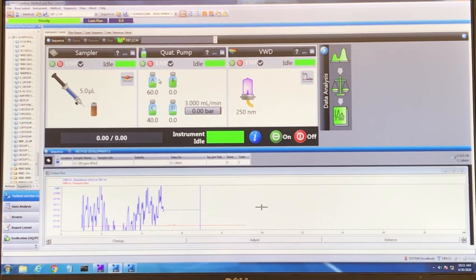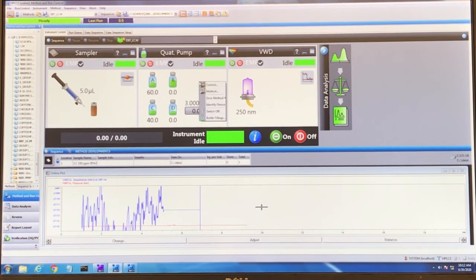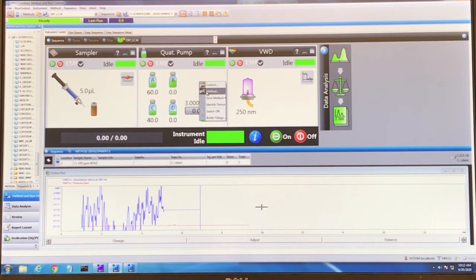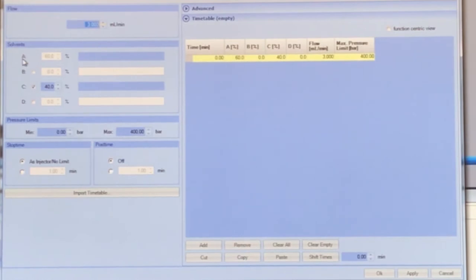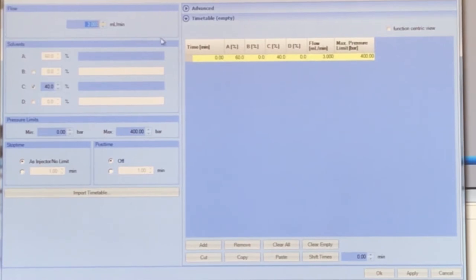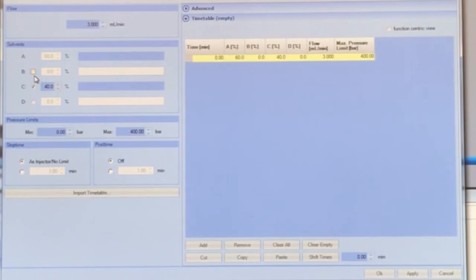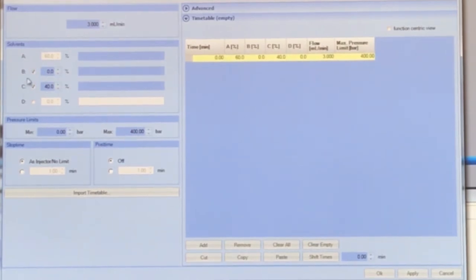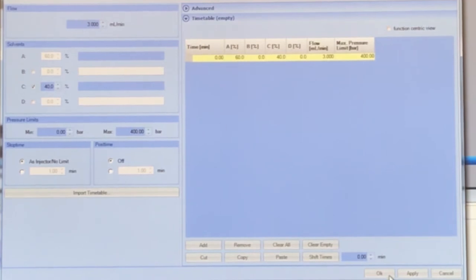Right now I'm using solvent A and C. A is water and C is methanol. If you right-click and go to method, you can see that A is always selected as our default, and then C has a checkbox. We've got 40% C and 60% A by volume. If you want to change those, you can just type in the number you want. If you want to switch to a different solvent, for instance acetonitrile, you would check box B and put in the percentage you want. I'm going to leave it at 60-40 water and methanol.